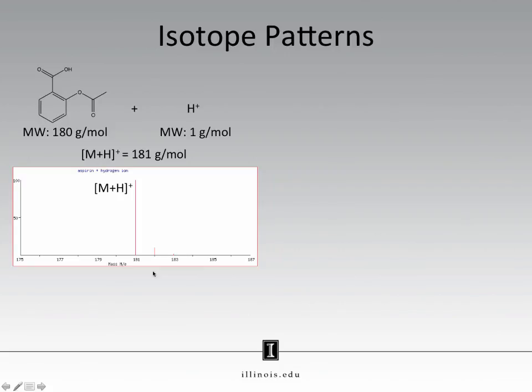If you look at the periodic table of elements, you will see carbon has an atomic weight of 12.011. That atomic weight is an average of all of the isotopes of carbon. If you take a sample of carbon, almost 99% of that carbon will be carbon-12. About 1% of that carbon will be carbon-13, and a minuscule amount of that carbon will be carbon-14.